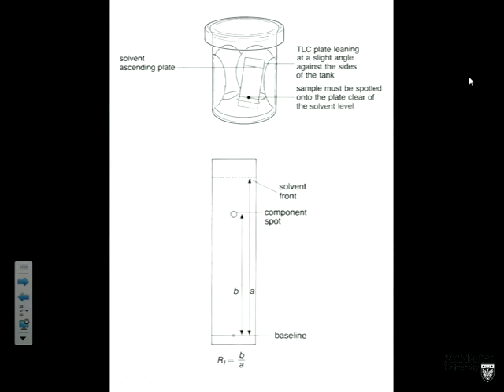Okay, we cut a piece of TLC plate. This will be given to you in the lab, right? We mark with pencil, because ink has got organic compounds in it, and we'll make a nice, pretty elution picture all the way up the plate. So use a pencil to mark a spot.